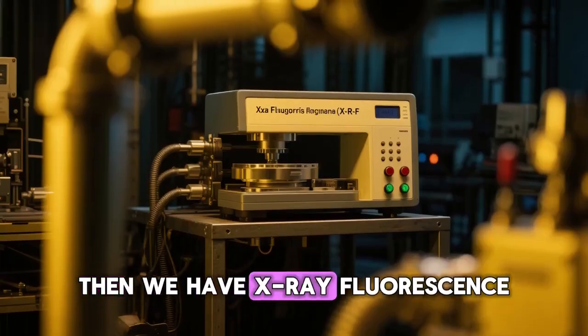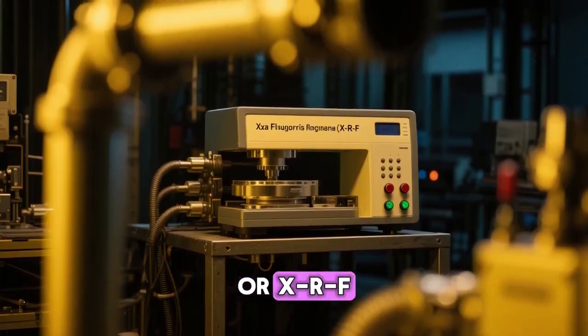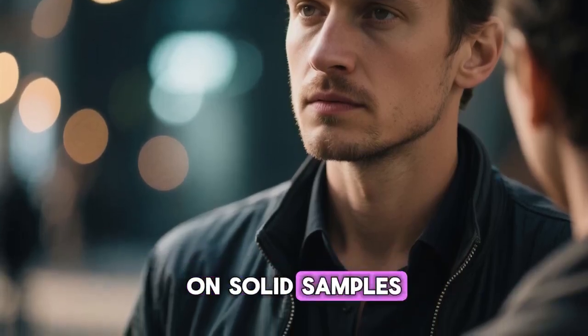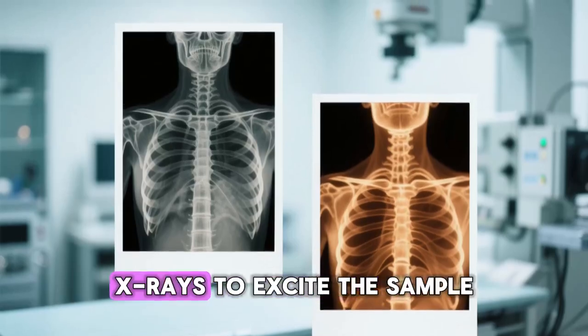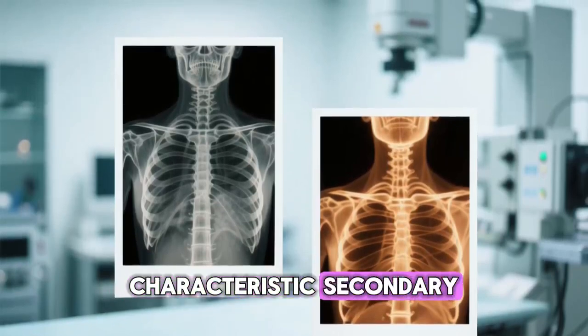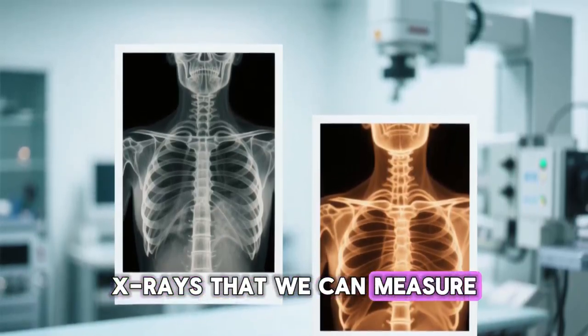Then we have X-ray fluorescence, or XRF. This is a very common method that works directly on solid samples. The technique uses X-rays to excite the sample, which then emits its own characteristic secondary X-rays that we can measure.